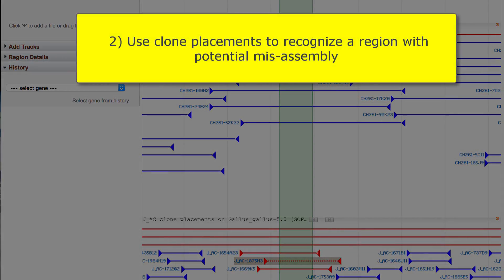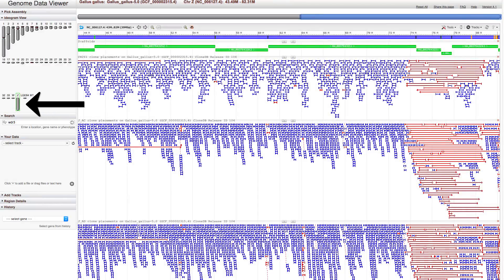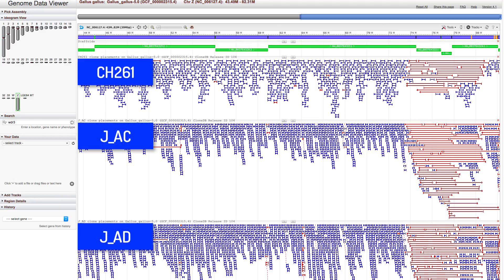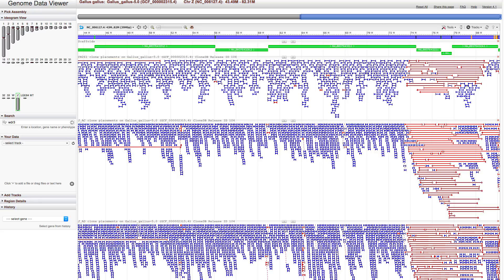Let's move on to the second example — a quick look at using clone placements to assess the quality of an assembly, in this case to recognize a genomic region with potential misassembly. I've moved over to chicken chromosome Z, and we see a dramatic change in placements from unique concordant to discordant at about 72 megabases. This change occurs in all three libraries, indicating a likely misassembly in this region. The DNA source for this Gallus-Gallus 5.0 assembly is the same as in the CH261 library, but different in the other two libraries, further supporting a misassembly here.